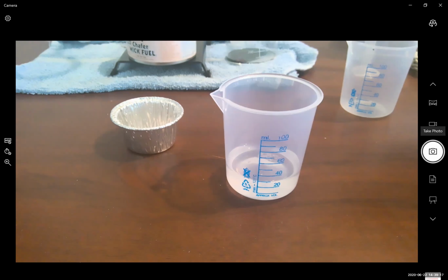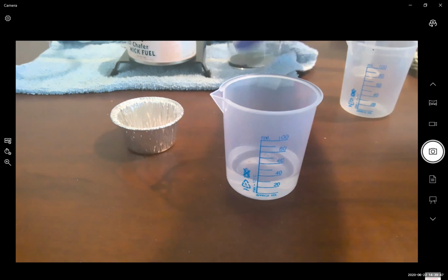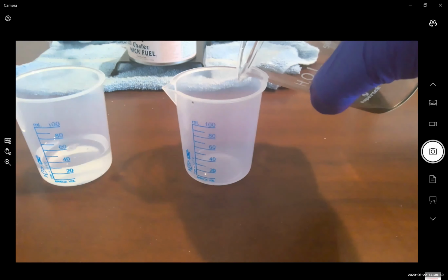So at this time, now that everything has cooled, you're welcome to resume placing your gloves on. Okay, and now we're going to take our beaker, which should be relatively cool now, and pour the liquid contents into our waste container. So this will be our waste container, and we're going to carefully pour the liquid contents.